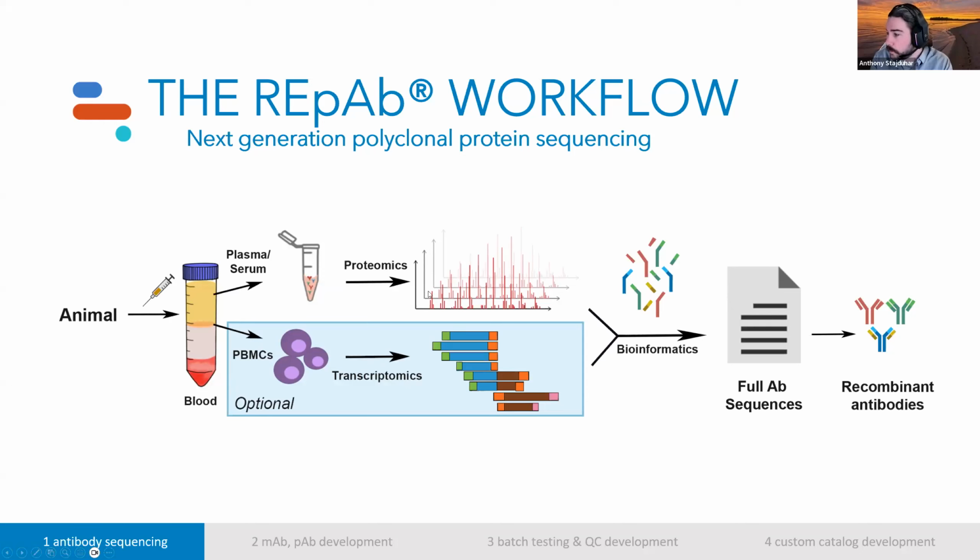We will put them on the LC-MS. We'll generate spectra, and we will generate a list of prospective heavy and light chains. We've also developed a proprietary method for pairing the prospective heavy and light chains together, so that we have at the end a list of paired cognate heavy and light chains, so that we can express the full-length IgG, again with perhaps someone like evitria. And then you can use those recombinant monoclonal antibodies to whatever needs you have.